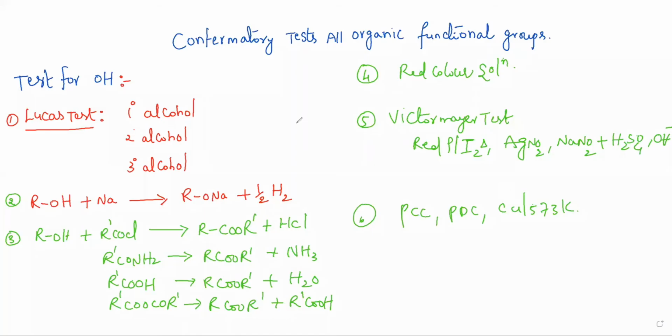Hello dear students, today we are going to discuss a very important concept for all the competitive exams, even for lab. The concept is called confirmatory tests for organic functional groups. It takes a lot of time, so we are going to segregate the overall functional group confirmatory tests into two videos. In the first video, we will start with the tests for alcohols.